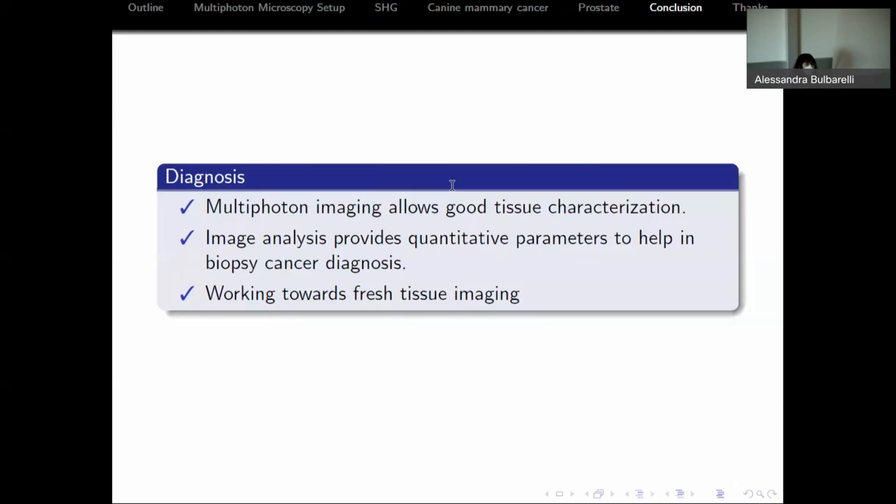after we get some way of saying which is the most important parameter, so we don't need to do it in the HE images, biopsies anymore. So it can be a faster way that we can just get the tissue cut as in the first image and do it without any processing, any other color and cutting, in specific sample preparation, to be able to see if we can compare that with the patient prognosis.